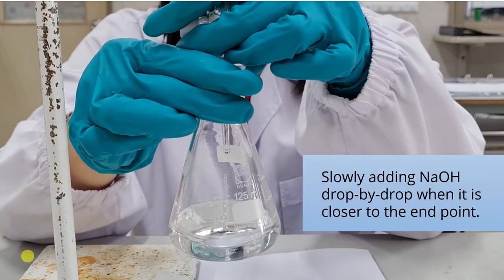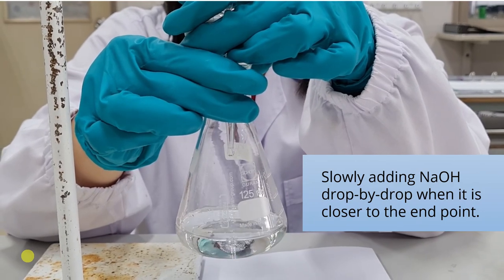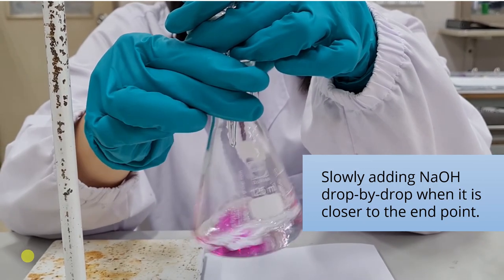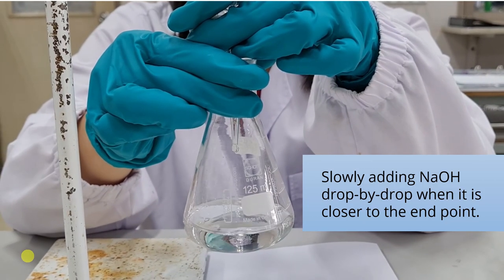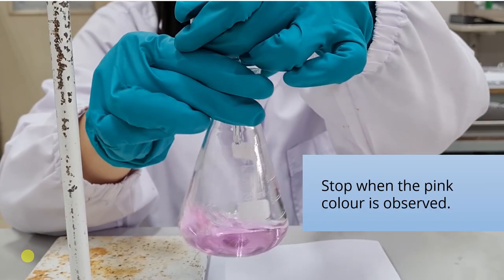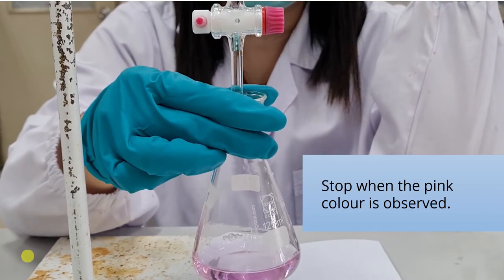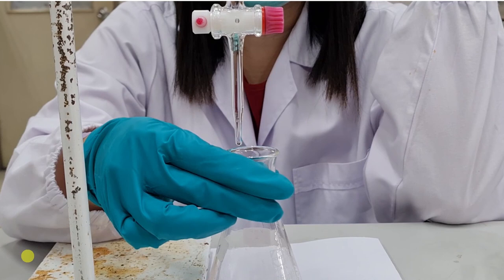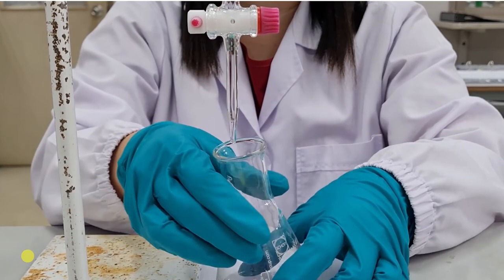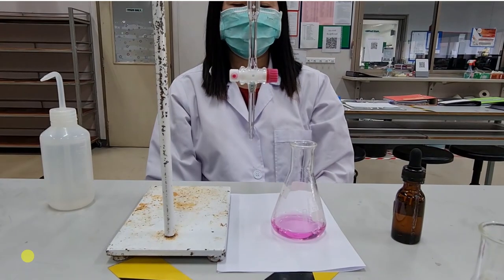So that when it's near the end point, or when the color stays a little bit longer, you do the titration by adding sodium hydroxide drop by drop. When the pink color is observed, you stop, turn off the stopcock, stop the flow. So the titration is done.